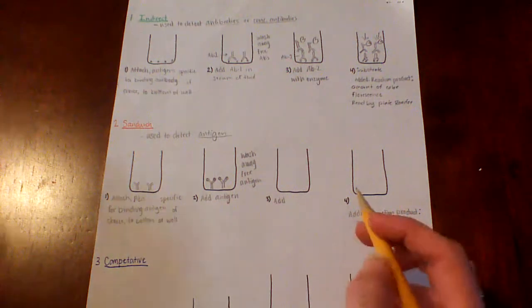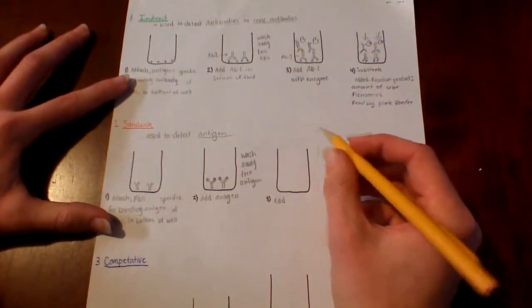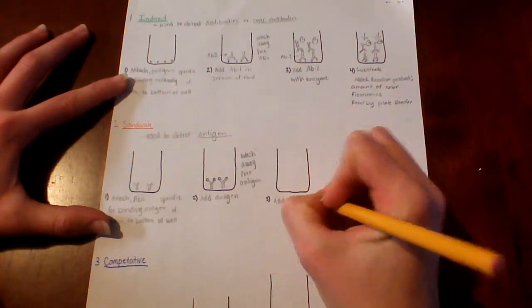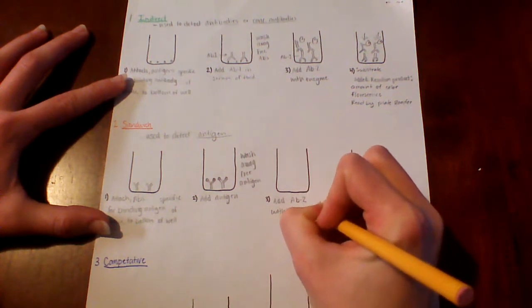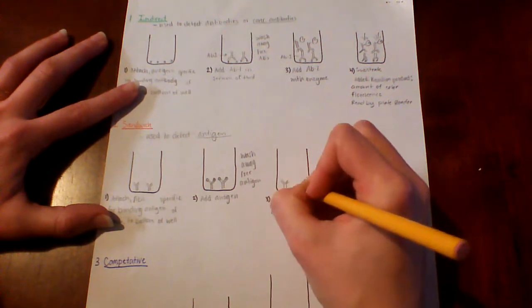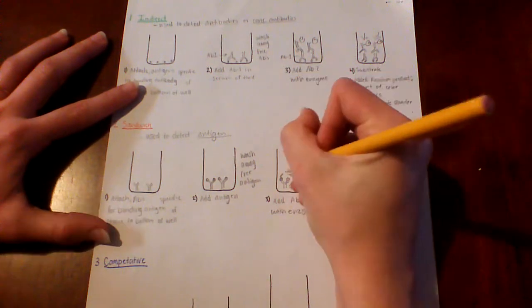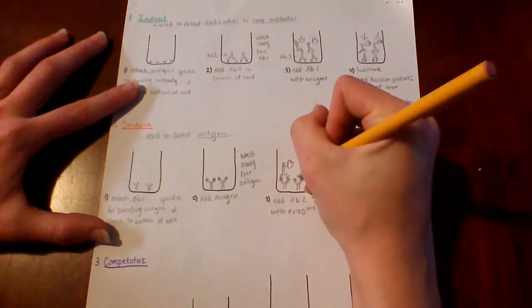Okay, so for the third step, it's going to be like the step above. A secondary antibody is added to the solution with an enzyme attached to it. So the antigen is sandwiched in between these two antibodies. Draw Pac-Man enzymes again.